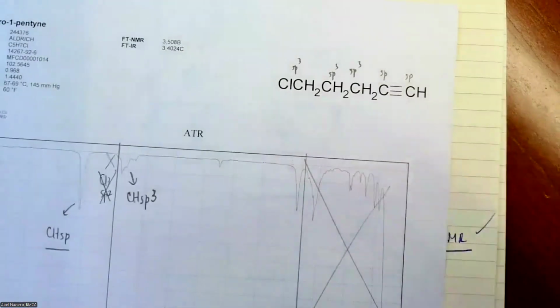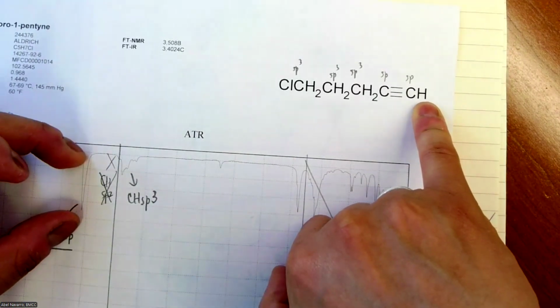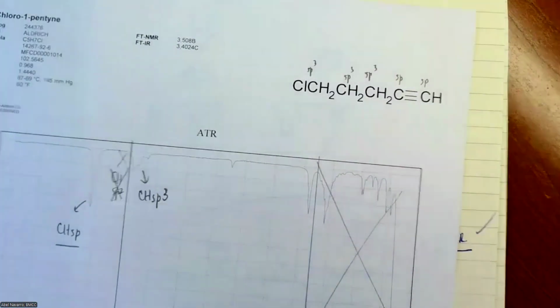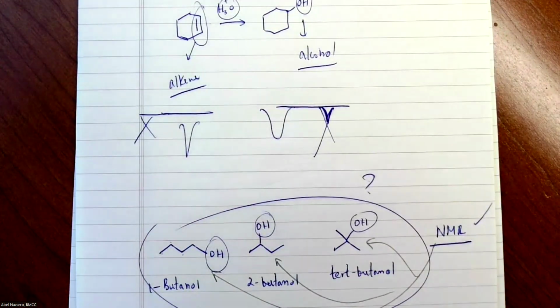Right? Once again, the intensity. You might be wondering, Professor, why, if this one is only one CH, is this peak so intense? And this peak, if there are so many, six, why is it so small? It's just like a mystery of IR. Molecules are picky and they just vibrate in a particular way, so they are not necessarily proportional to the amount.